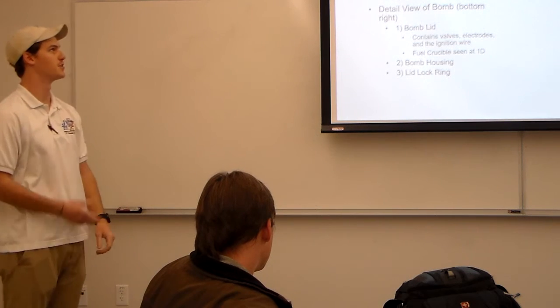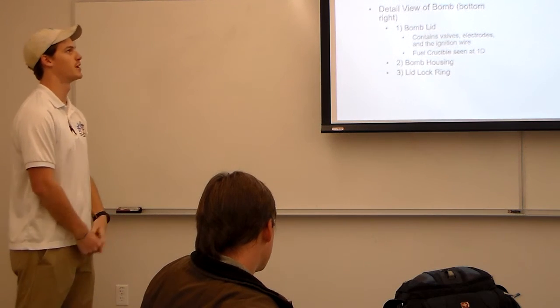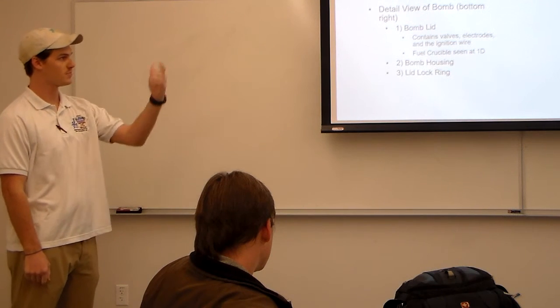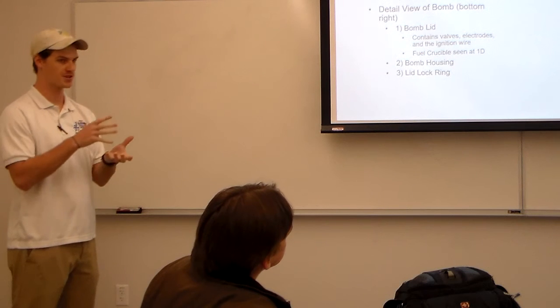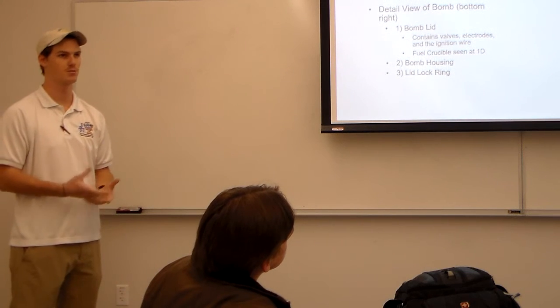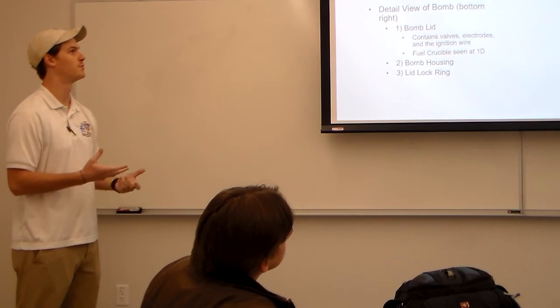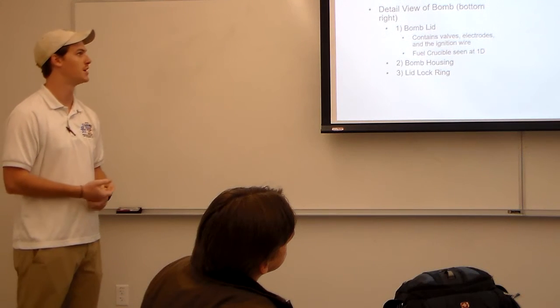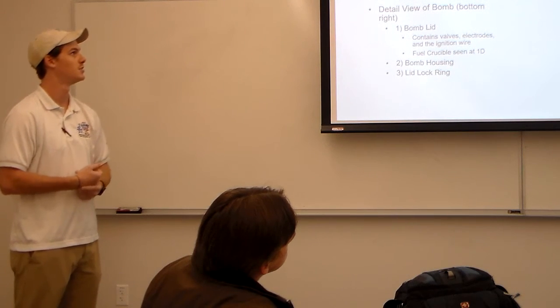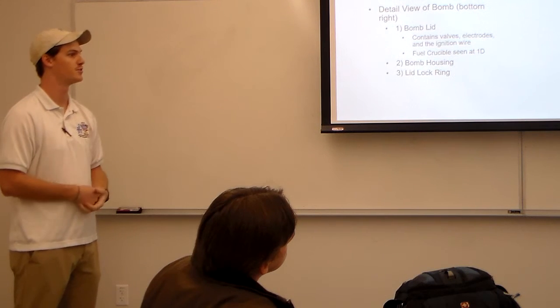So our apparatus is the PAR oxygen bomb calorimeter. You see on the top right, number 2 is the stainless steel bomb itself. This is where the combustion will take place. Number 5 is the water bucket. That's the water bath where we'll be measuring the temperature as it changes. We have a thermocouple and we have a stirrer.